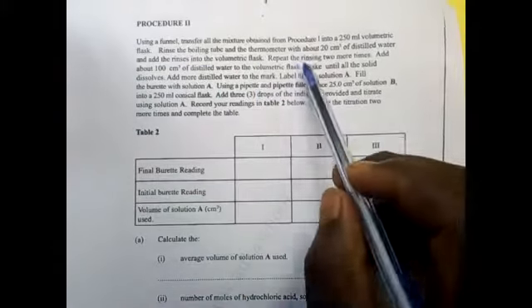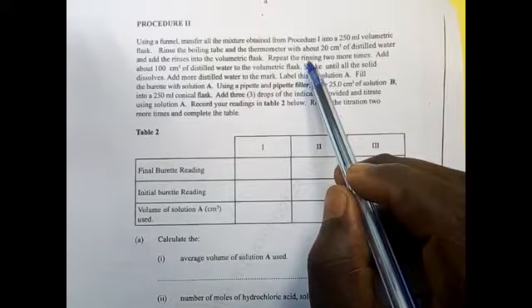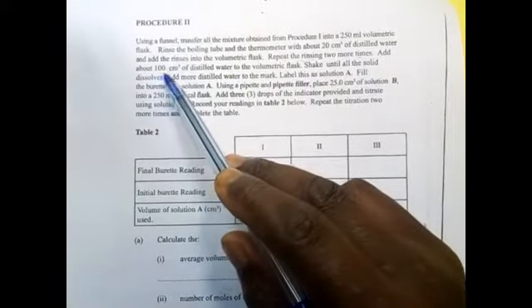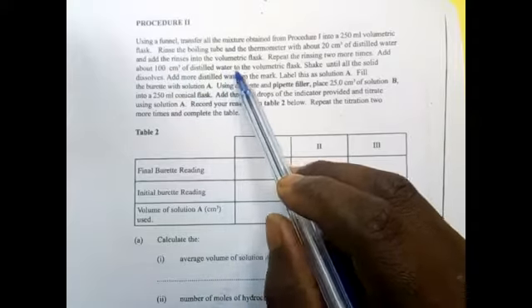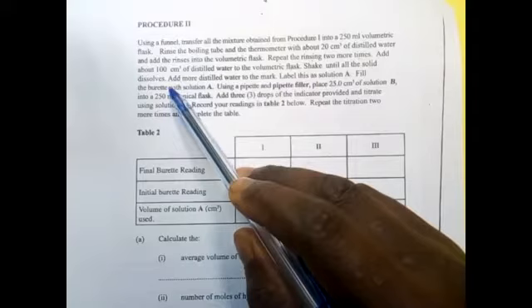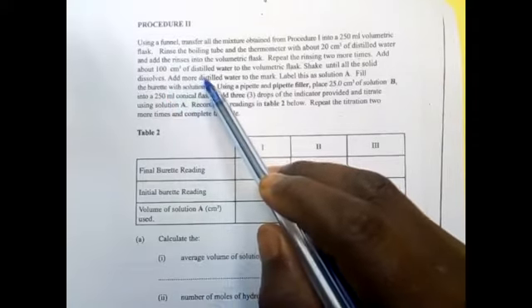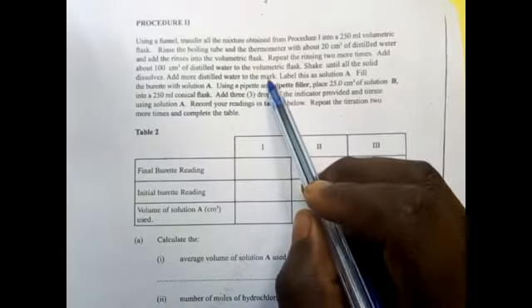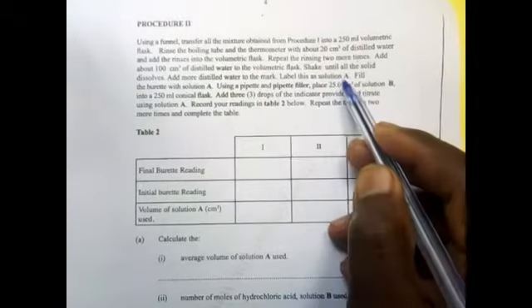Repeat rinsing 2 more times and add about 100 centimeters cube of distilled water in the volumetric flask. Shake until the solid dissolves. Add more distilled water to the mark. Label this solution A.